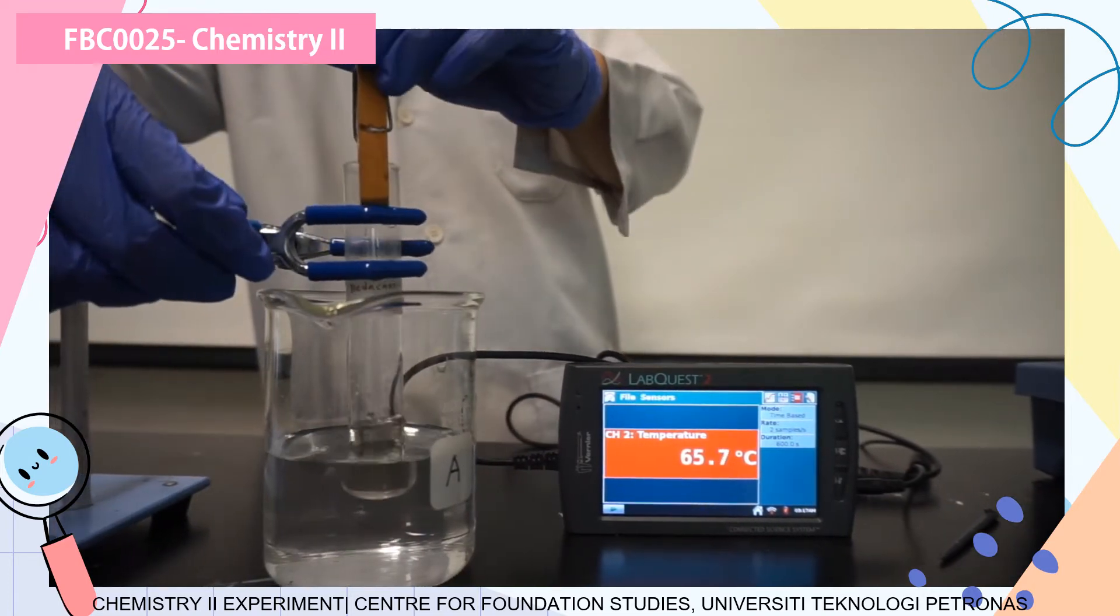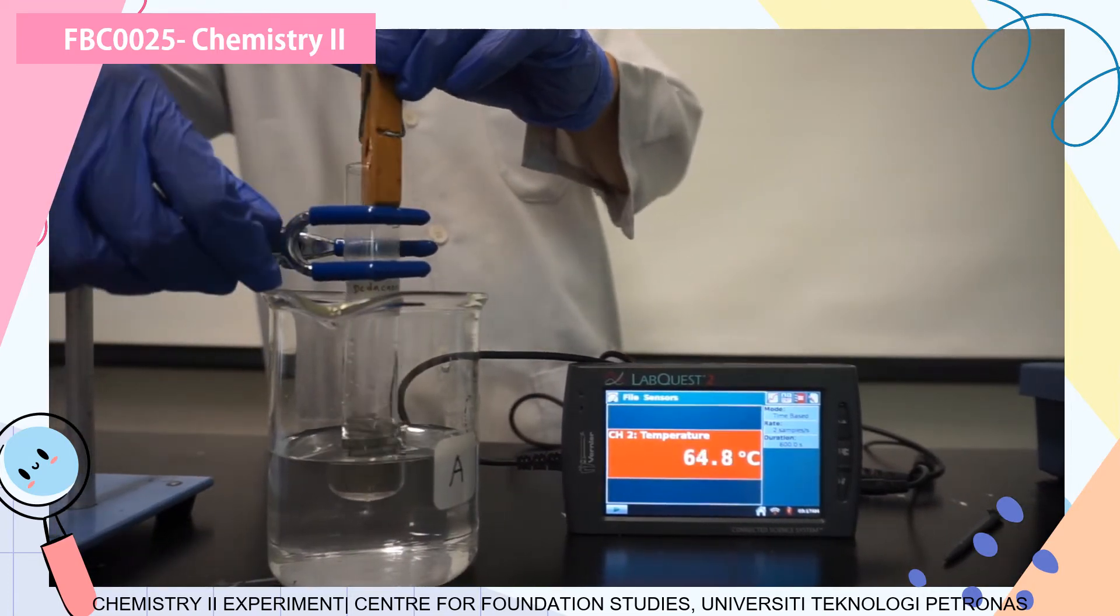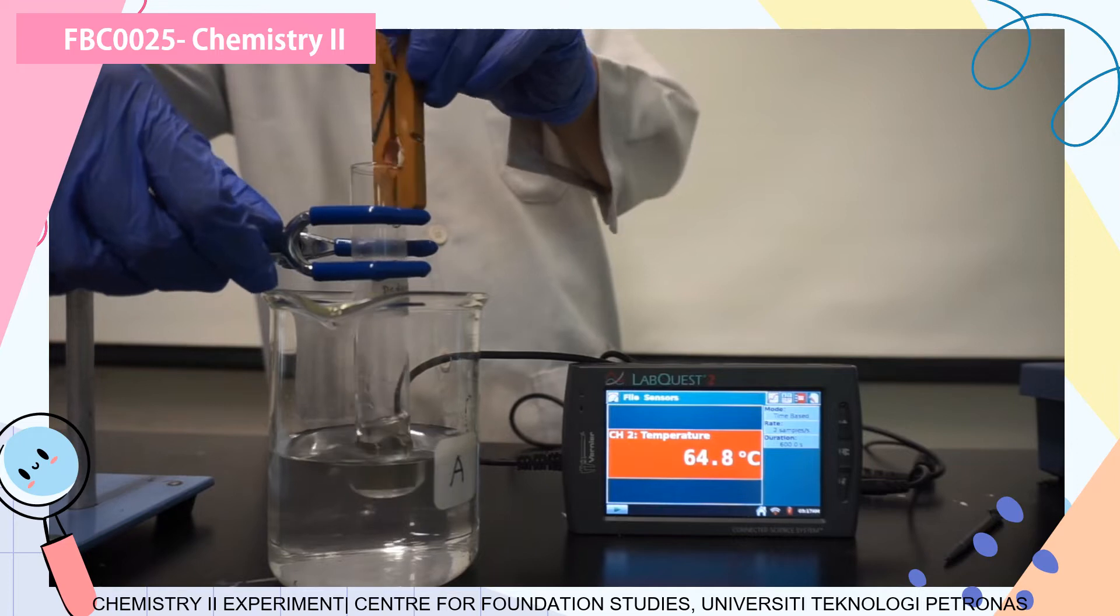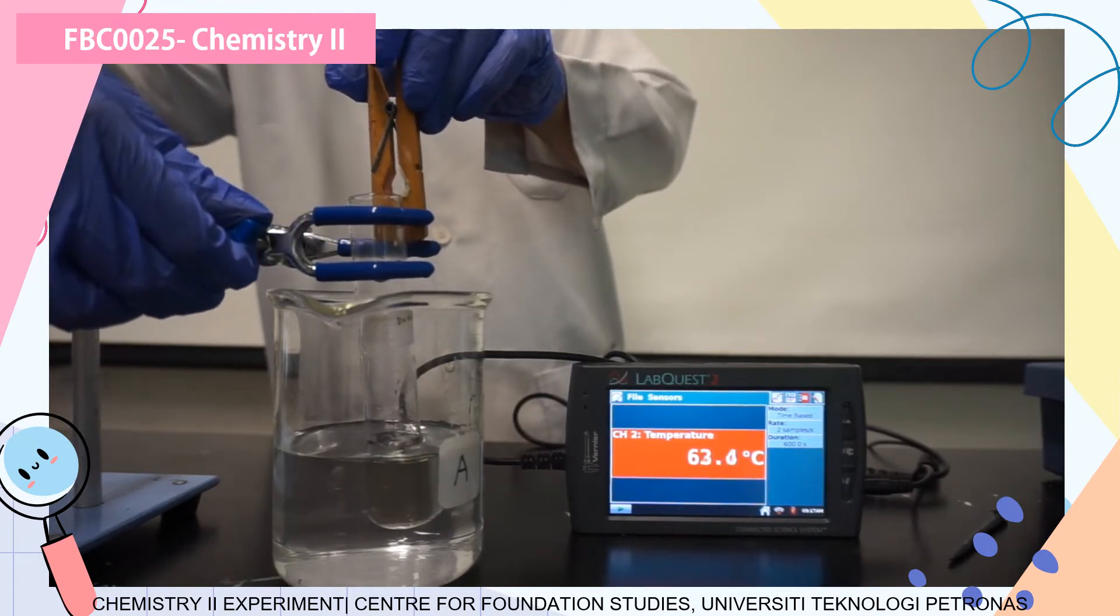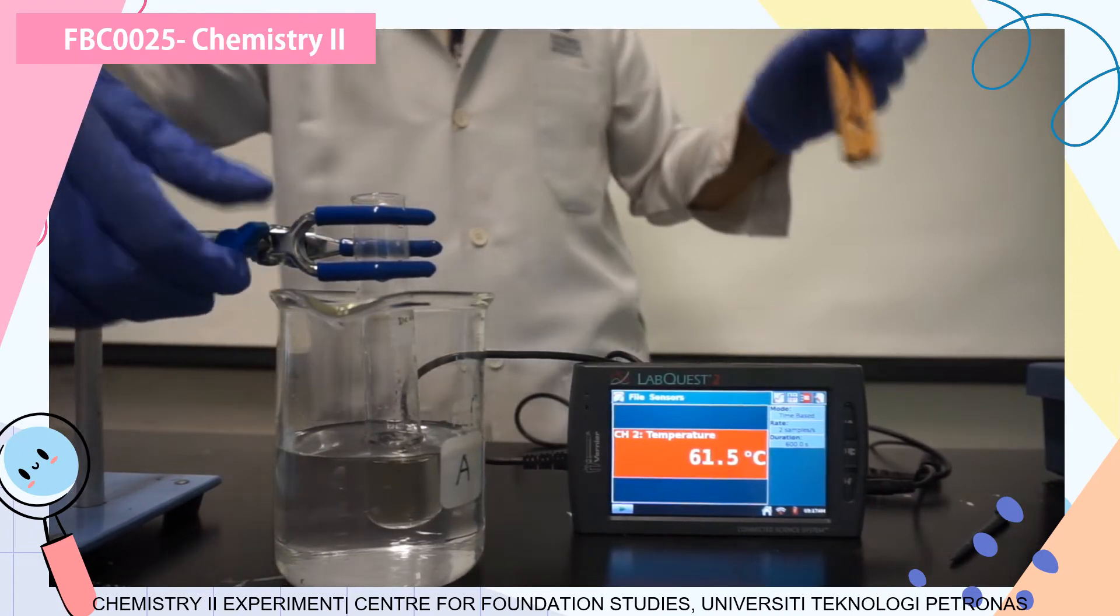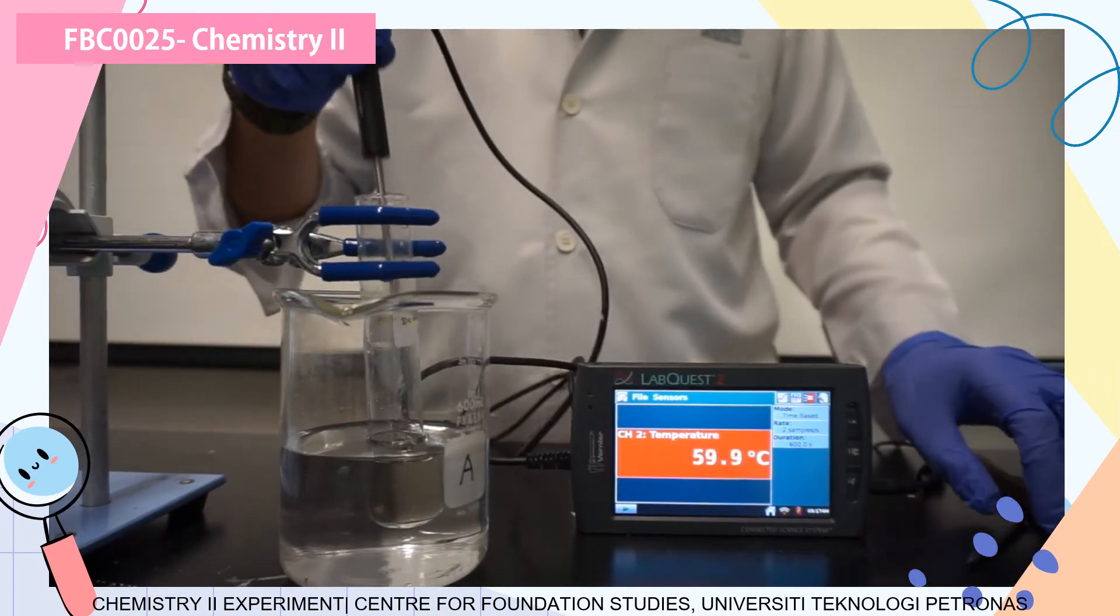Then you are going to transfer this lauric acid into a boiling tube. This is a boiling tube. Can you see that it is in liquid form? Just now when you weighed it, it was in powder form. Actually, because you are heating it up in the hot water bath first. We are going to transfer it into this beaker and make sure the level of the lauric acid is lower than the water bath level there.